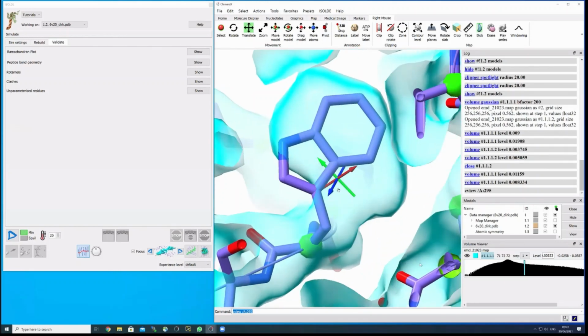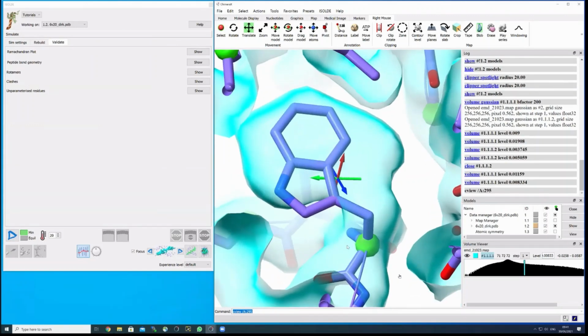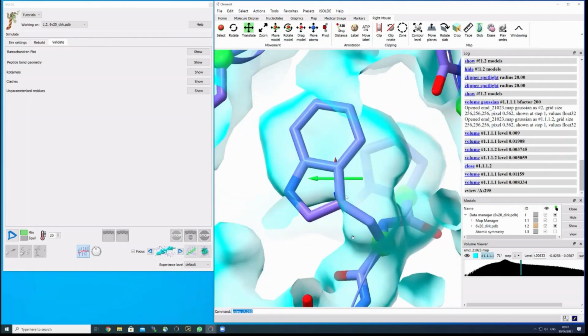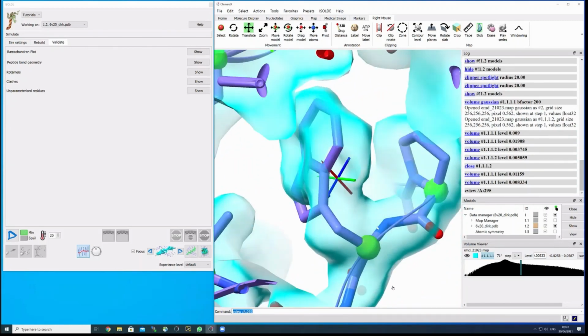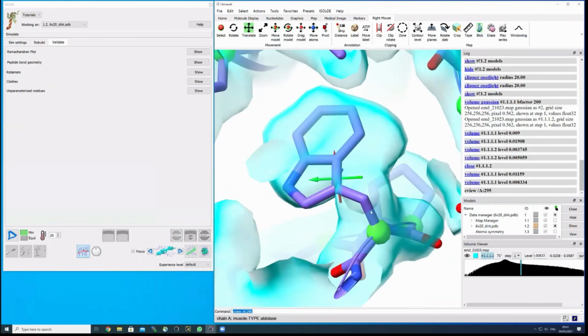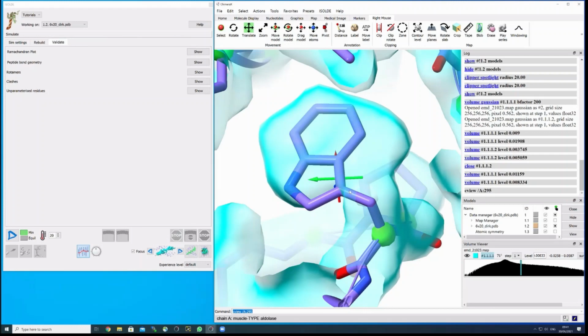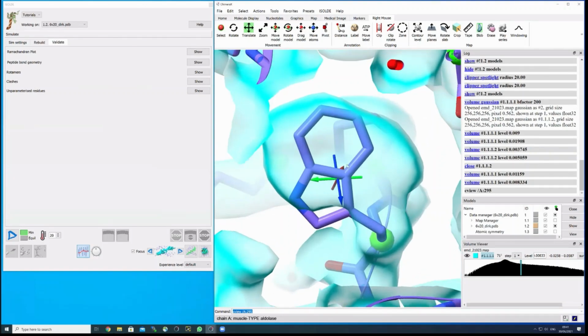And you don't have to be a magician to see that this can't be. Personally, as a model builder, I cannot stand to see such nice density, which we rarely have, and you see how wrongly it is modeled. Another thing where z-scores could probably be very beneficial. You see that the backbone geometry is just fine. It's a green dot here. You don't see any marks for an outlier of the sidechain. But obviously, the sidechain is in the wrong position.